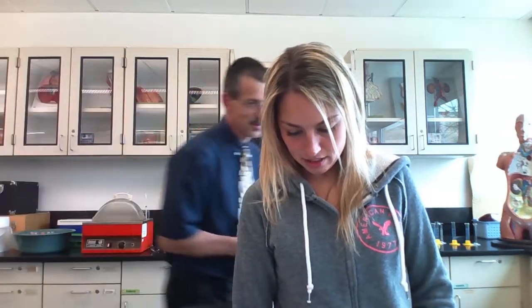Milk? It was milk, a dairy product. What's in it? Lactose, fat. Fat, okay. Oh, this is the fat. So this is what breaks down the fat. This is the fat. Yes. Okay, so now go back to 112.